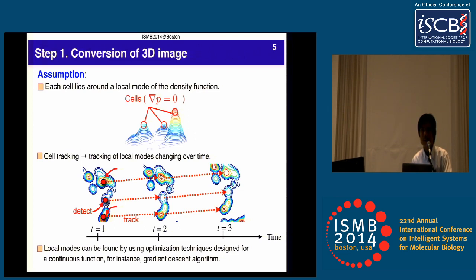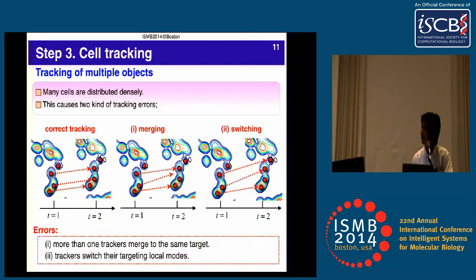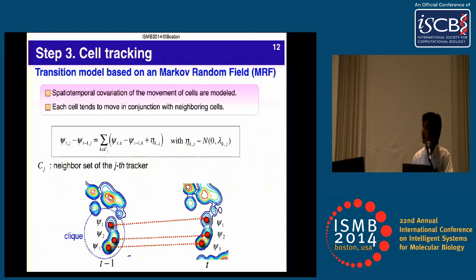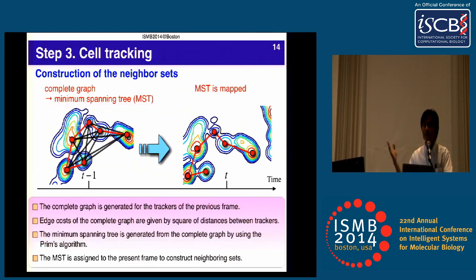I have another question. So with the minimum spanning tree, I think this is also very much tailored to the data that you have, right? Why don't you just use k-nearest neighbor or something for the local neighborhood? Because if you have more dense tissue, this would pretty much completely break down because the MST would change a lot with rather slight modifications. So I don't see why you need the MST.